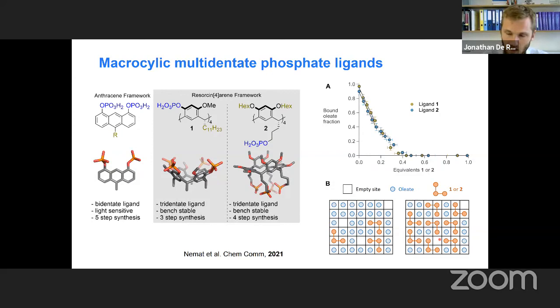That's why at high surface coverage, these multidentate ligands cannot bind as multidentate ligands. They have to adapt to the number of available binding sites that are close to each other. So yes, good to improve the denticity, but be aware that it only works at low surface coverage.